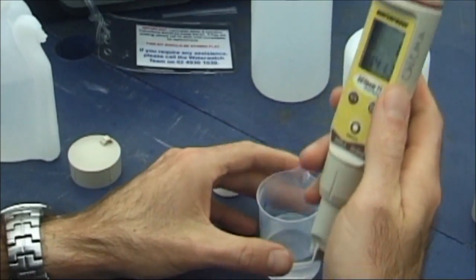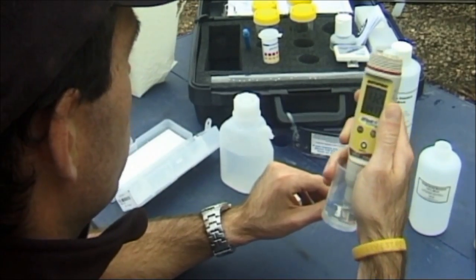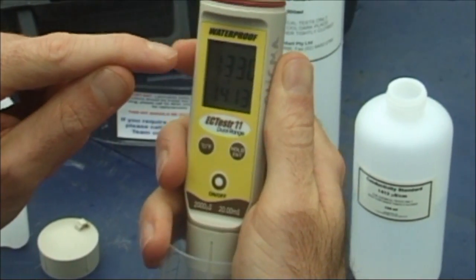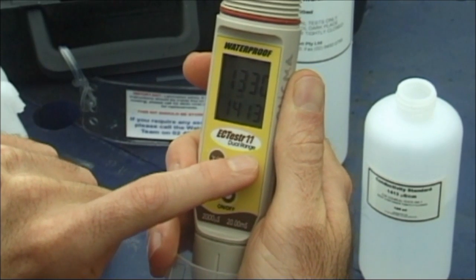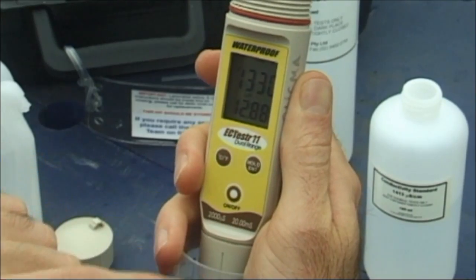Place the probe into the solution. Rotate your wrist. When the reading stabilises, press the hold button. The screen will display CO for 2 seconds. The meter has confirmed the measurement. 12.88 millisiemens will now flash on the screen.